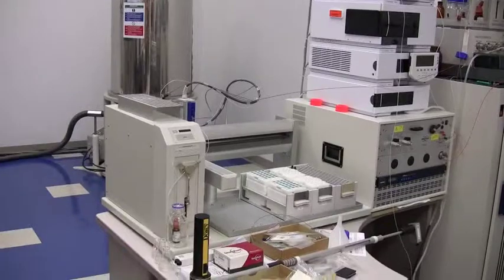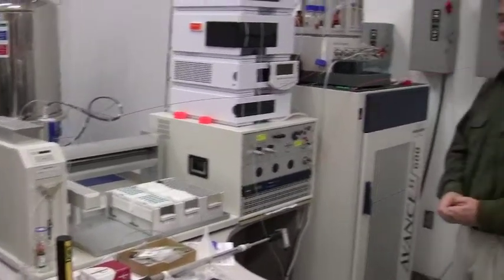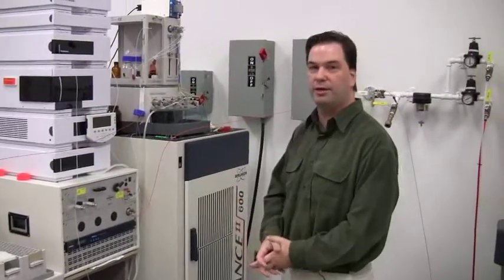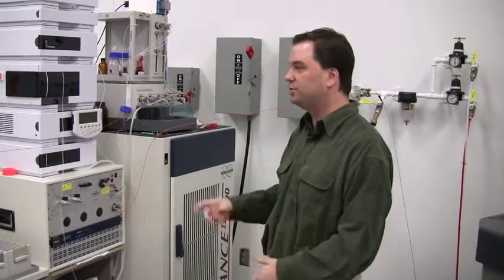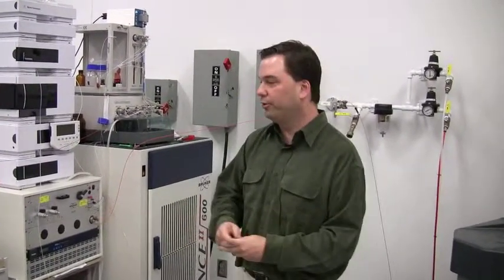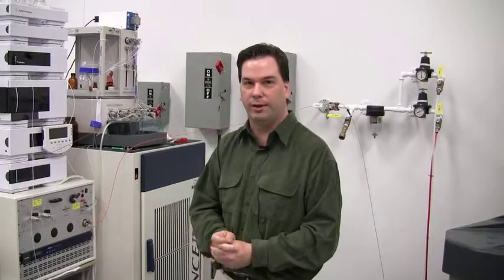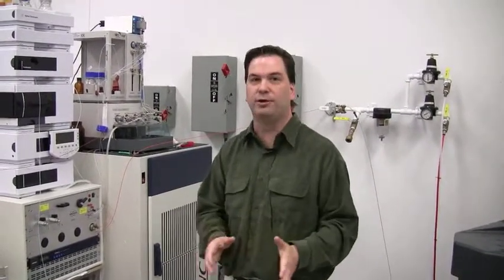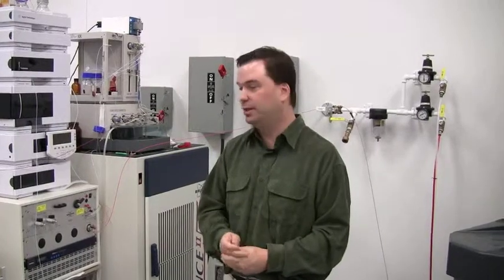We're able to trap up to 96 peaks at a time. We have 96 cartridges that are available, and we're able to send them over to the NMR spectrometer or to the Gilson liquid handler in an automated fashion. Students or users aren't responsible for manually transferring the samples. It's all done under automated system.